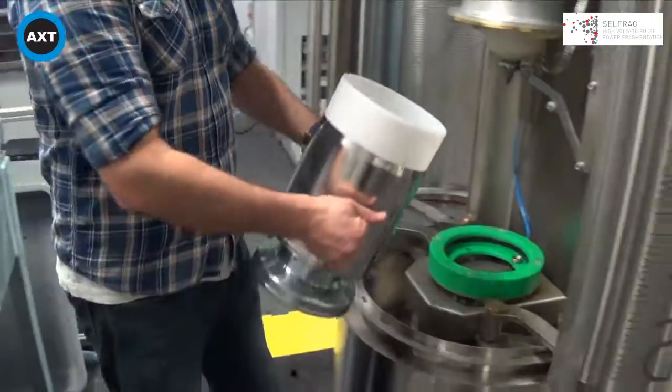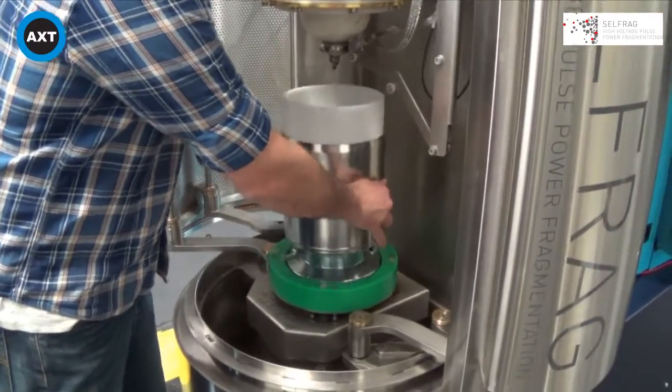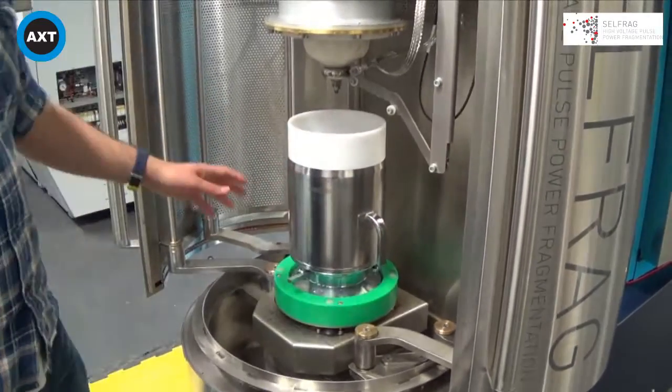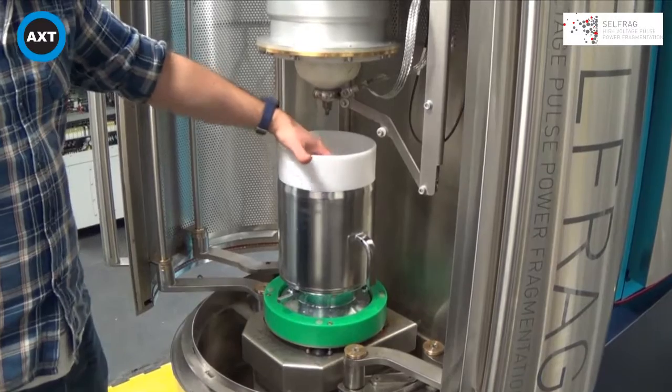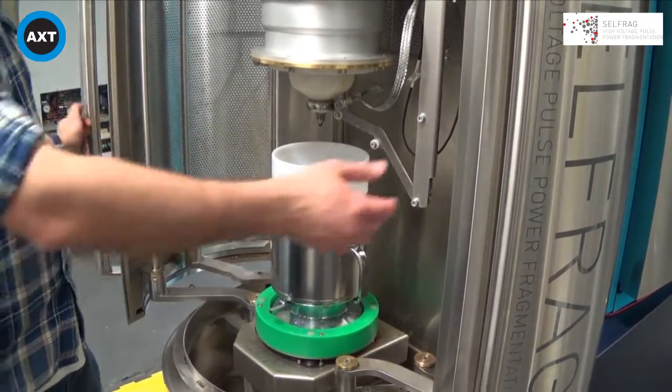When it is time to process, we fit our process vessel inside the machine, put our sample on top, fill with water to the line, and then close the doors.